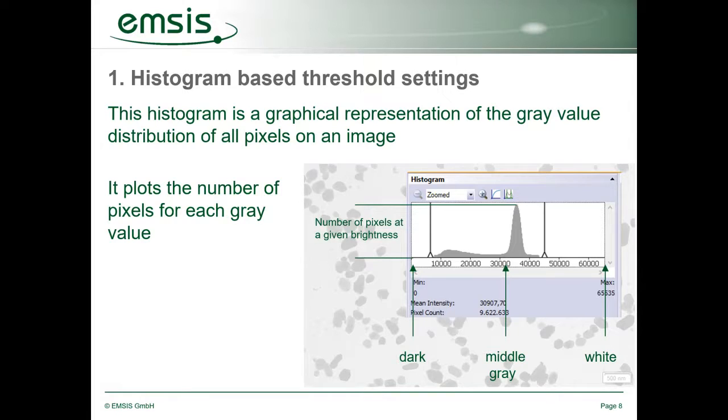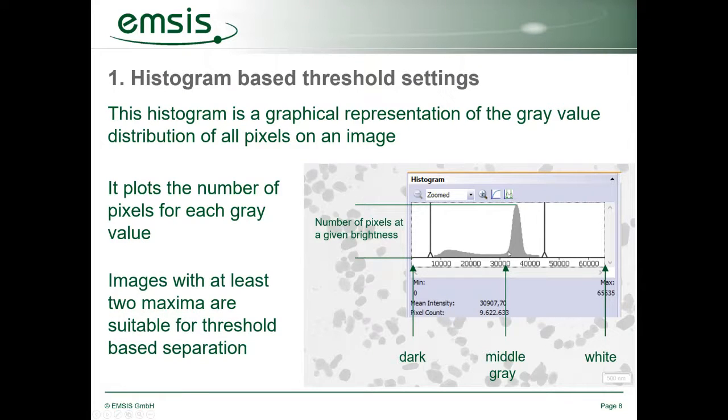So I'm switching back to that. What you can also see here is a minimum between the two maxima, and this is always an indication that such an image is very suitable for a threshold-based separation of particles.